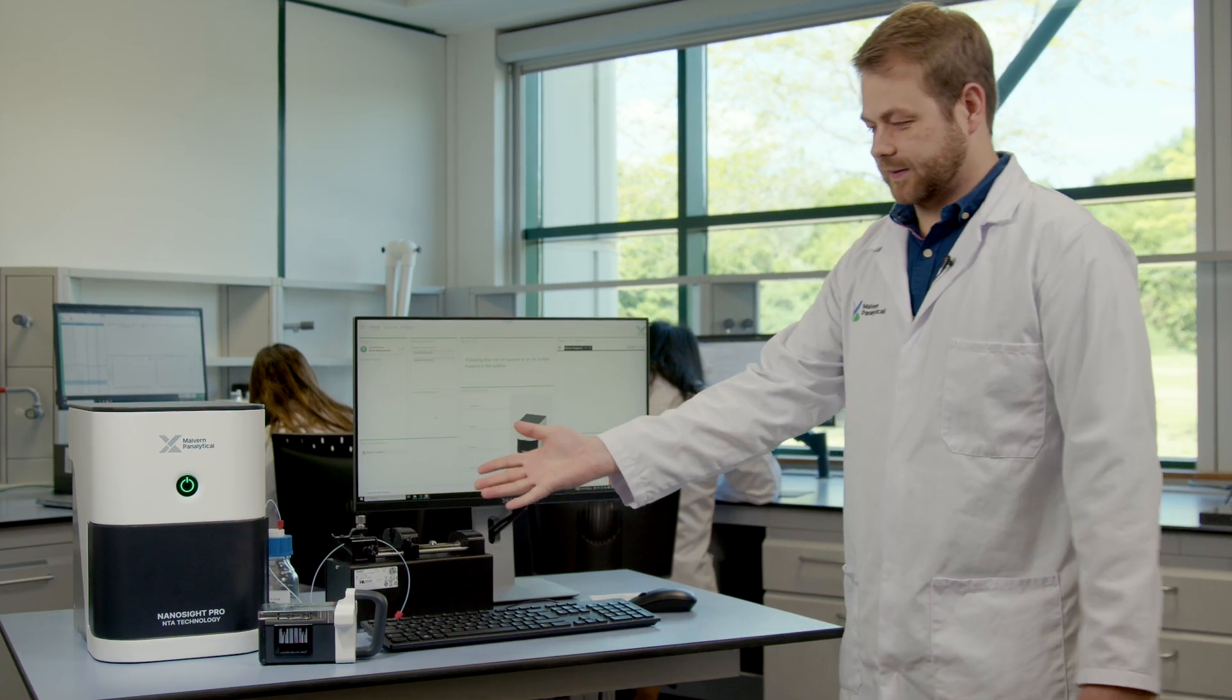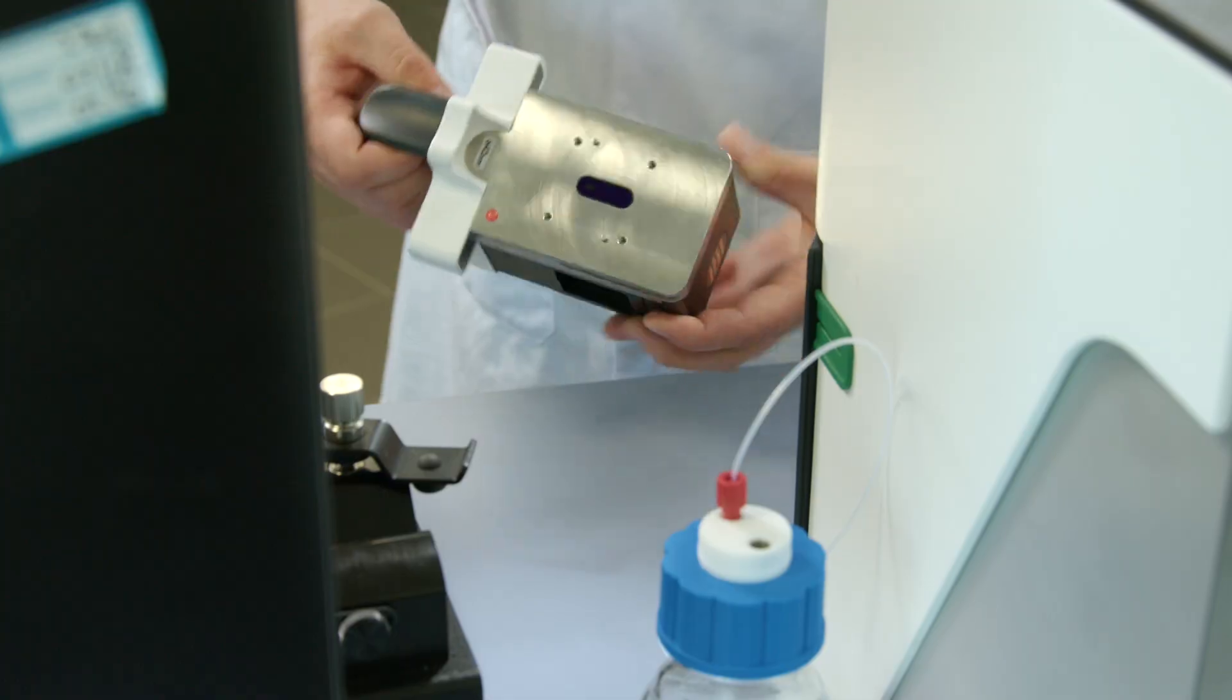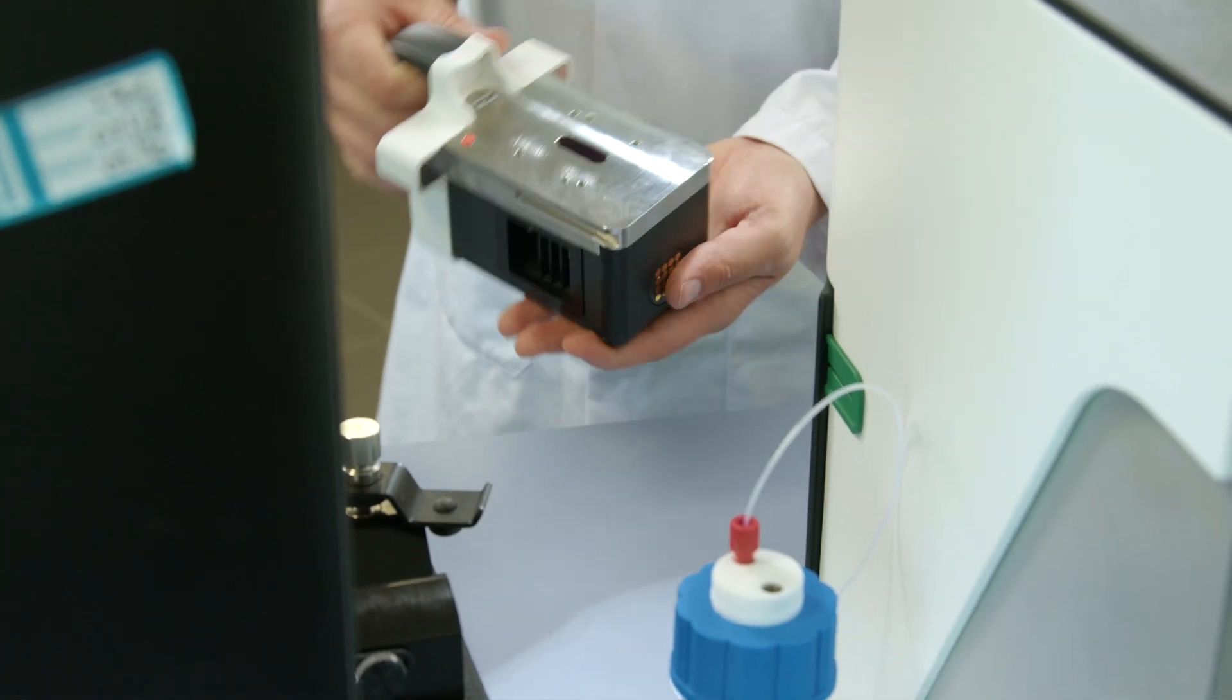So to start off we're going to be talking about the hardware side of it. We have our laser module here, it's got a nice new grip on it, it's very ergonomic, makes it easy to hold.